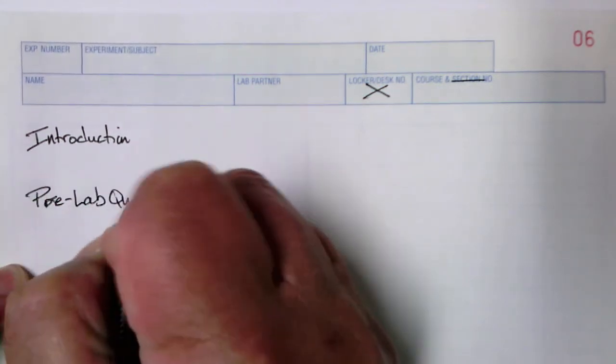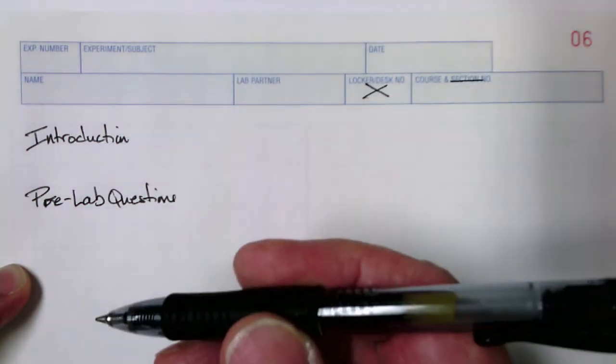Following the introduction, you'll probably have pre-lab questions. Those need to be answered in the laboratory notebook, and they should be placed before any other materials. Make sure that it's clear that these are your pre-lab questions, or the answers to your pre-lab questions. It would be to your advantage to write out the question, the pre-lab question, and then your answer after it. Of course, always do it in pen, and it needs to be blue or black ink, not any exotic colors. After the pre-lab questions, you want to go on to your materials.